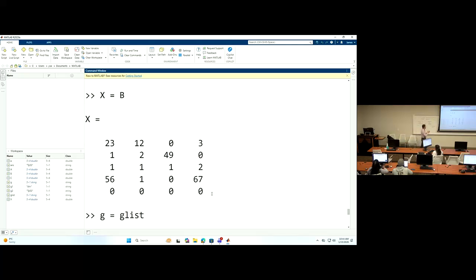Okay, this will be our very basic data structure we will play with in the real data analysis. We need two things. One is a matrix named variable X. It contains genes and cells. In this case, it will be 5 genes and 4 cells. The last gene has no expression in all the cells, so all zeros. Each gene has its name, so that name will be given into the G. So big X, small g, just remember, that's what we always need for the downstream analysis.